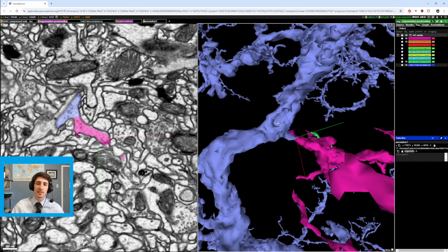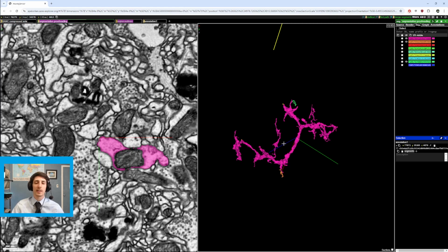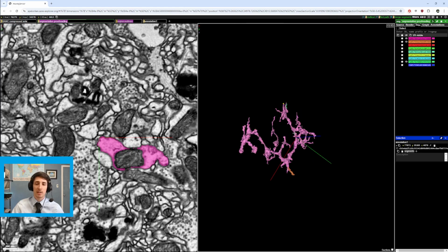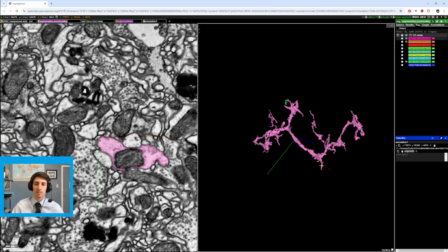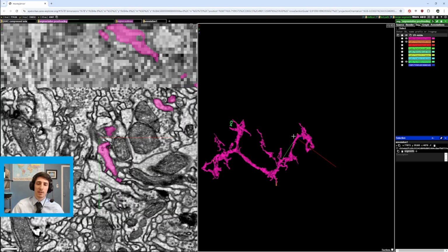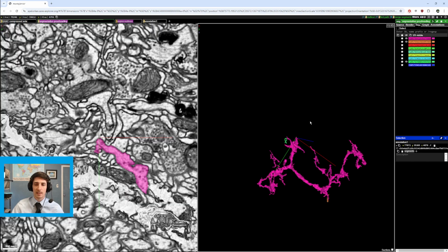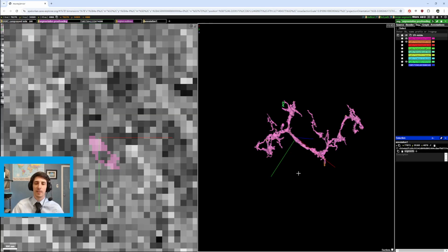And that is how I would go about trying to find where an interesting neurite would go. I would systematically go with my gut first. My gut told me here, my gut was wrong, bad gut. Then I would check over here on the end, check over here on the end, and then check each branch coming off of the main branch.